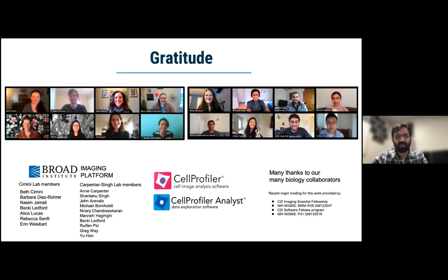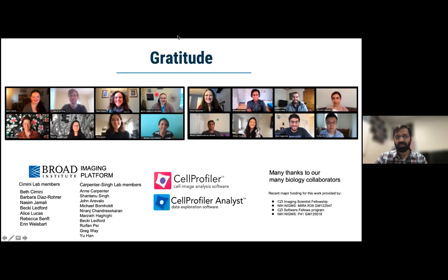All right, so while somebody has any questions in their mind, I'll go ahead and start with the first question, which is cell painting, of course. One of the ethos of your lab, as well as Anne Carpenter's lab, is make measurements first and then ask questions. With Juan's paper that you mentioned, it's very easy to get all the measurements with CellProfiler. The biggest hurdle is how to apply various bioinformatics pipelines to understand the relationship between the measurements. So what would you suggest and recommend for that step?